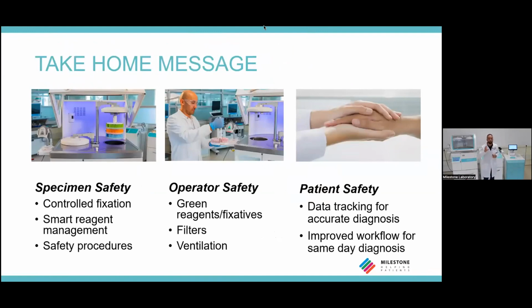We analyzed and proposed possible solutions for specimen safety, like controlled fixation or smart reagent management, and safety procedures for the operator, like commercial tanks, green reagent and fixative, safe working area, filter built in, and for the patient, the tracking of the sample that is really important, and an improvement of the workflow for the same-day diagnosis.